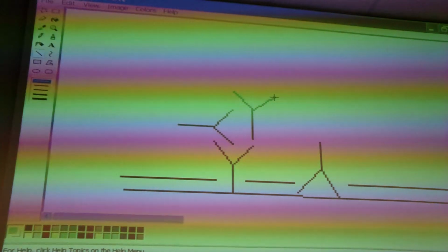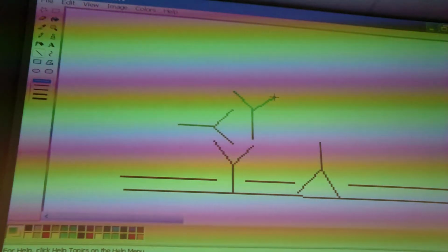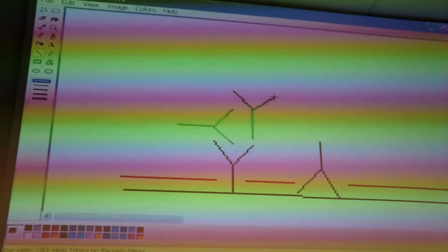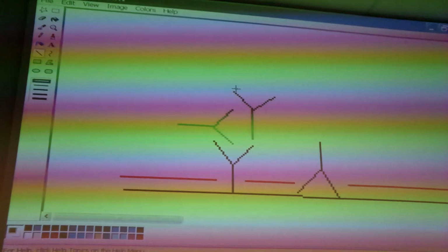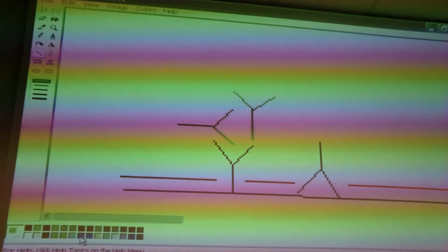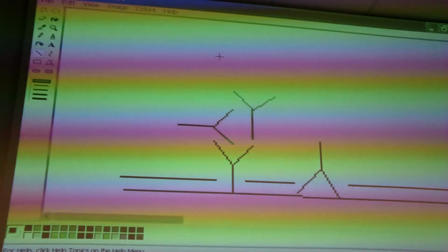How do we continue? Secondary antibody with labeling. Yeah. With what did you say? Labeling. A labeled antibody. What do I choose? Blue. Okay.